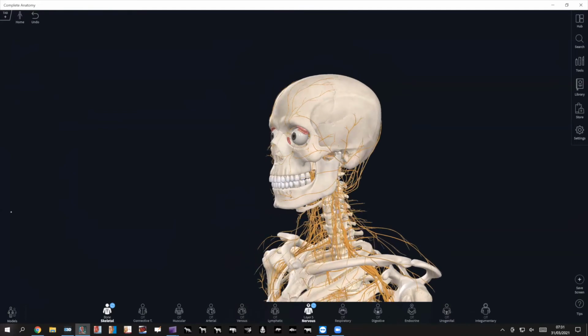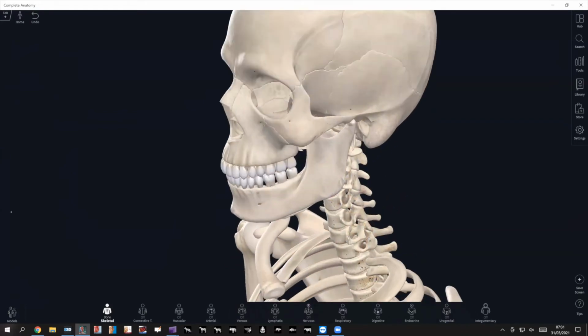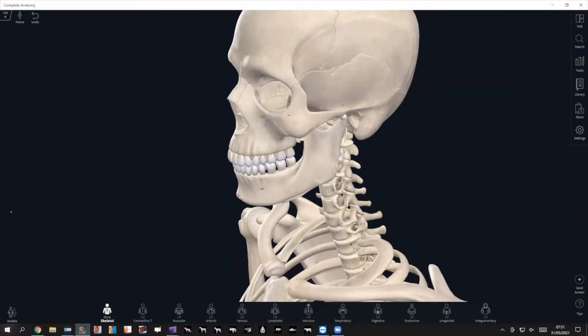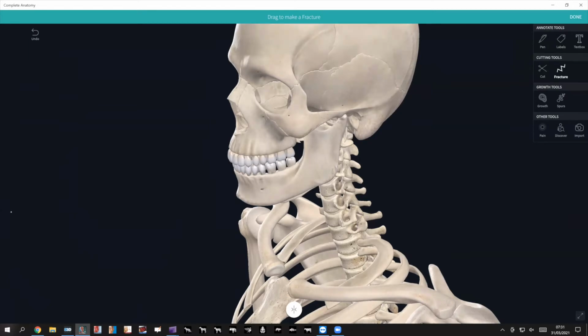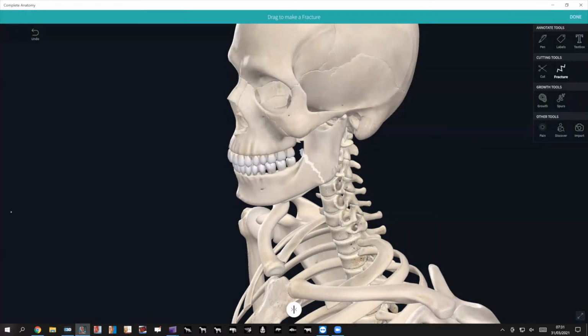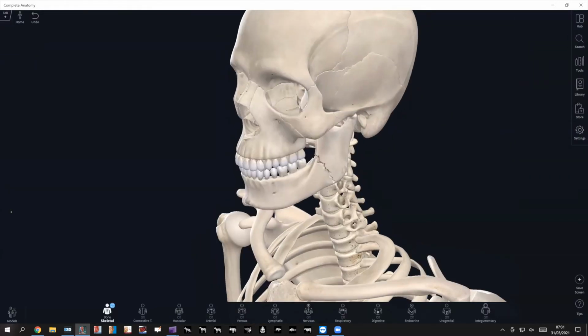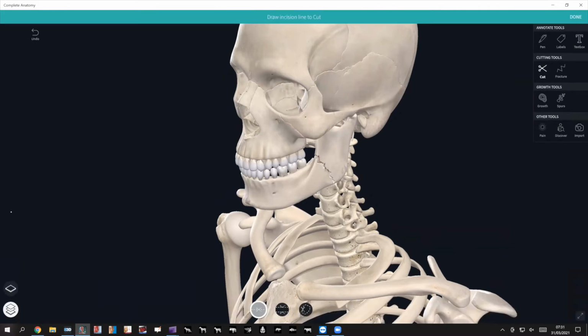So while he's doing that, it's important to say we can use the same structure for online teaching. So just imagine the professor would be with the platform. The professor can remotely access the platform if he or she wants, and we can share the same structure for the students. So the students will be able to see the screen, they will be able to see the camera, and the professor will be able to do the same class we're doing here for how many students you want, with unlimited access.